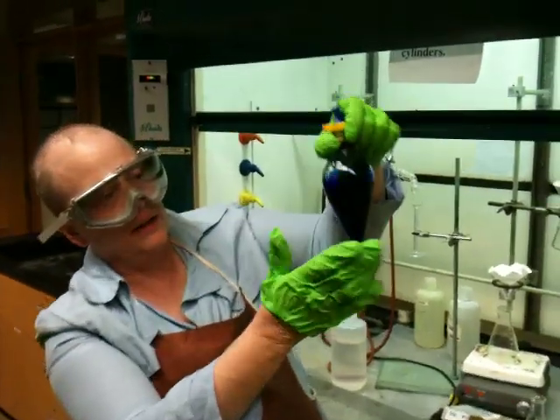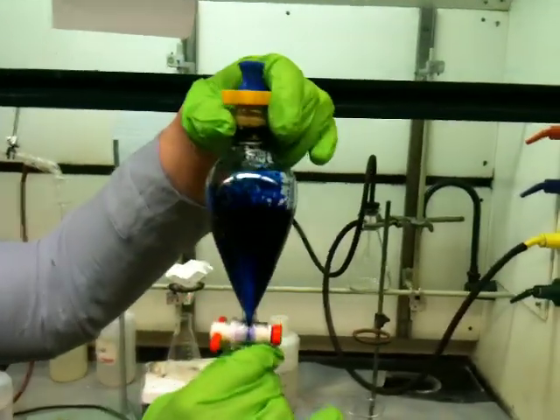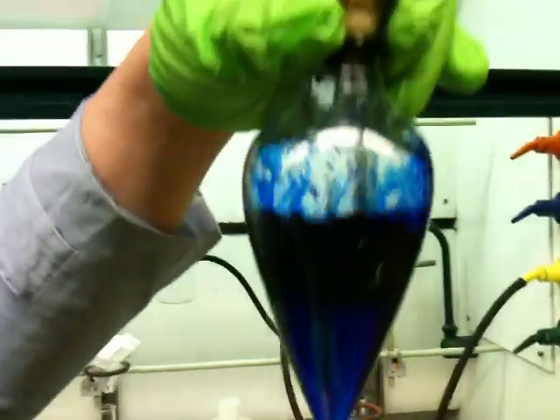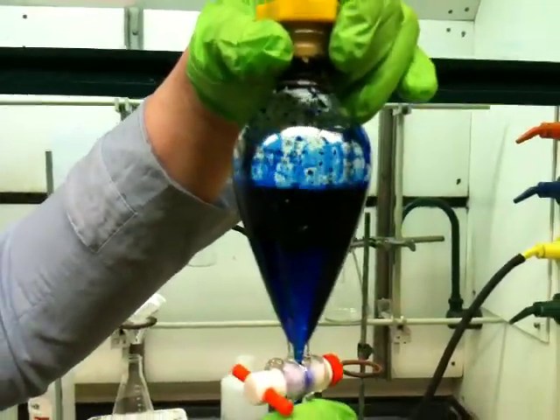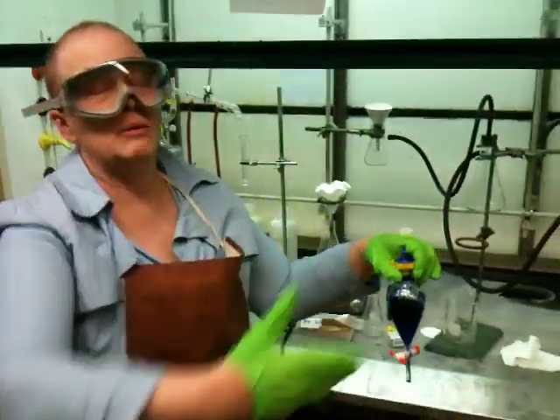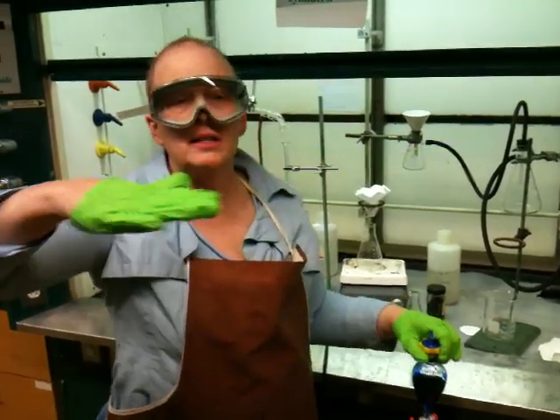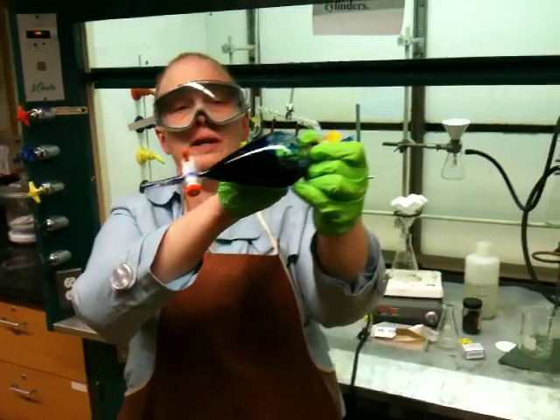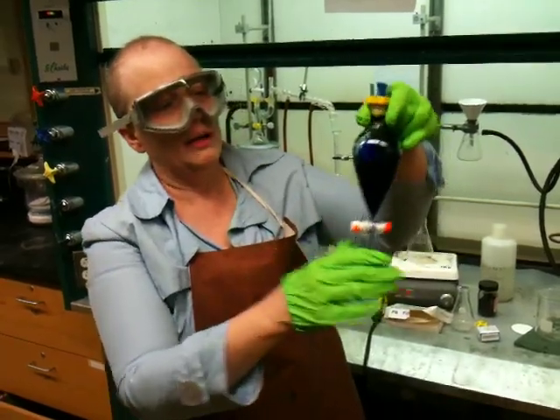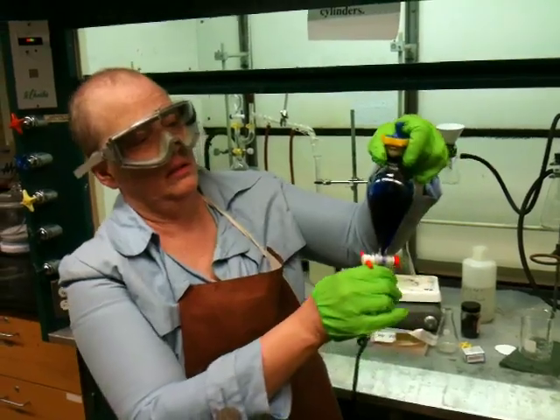Now you'll notice upon doing this the bottom layer has gotten a little darker. This is a very inky blue solution. Through the swirling, I was increasing the surface area between the two layers in a gentle way. When you lay it on its side there's a greater surface area between the layers. By swirling it, you get the layers to mix a little bit and you get a much more rapid equilibration between the layers, because this is an equilibrium process. So we want to speed that up, then separate the layers.